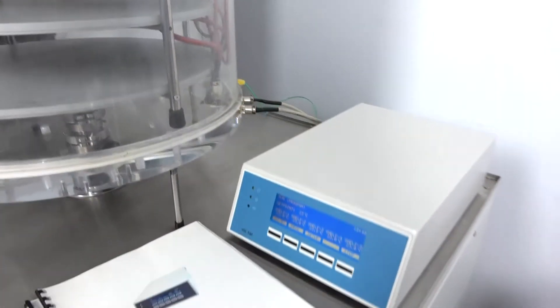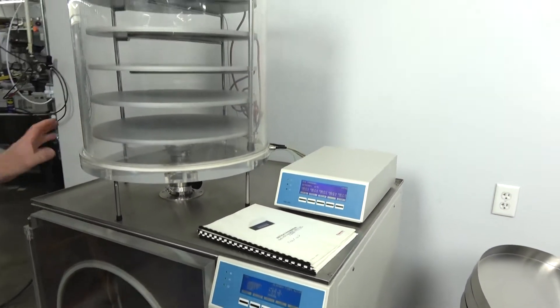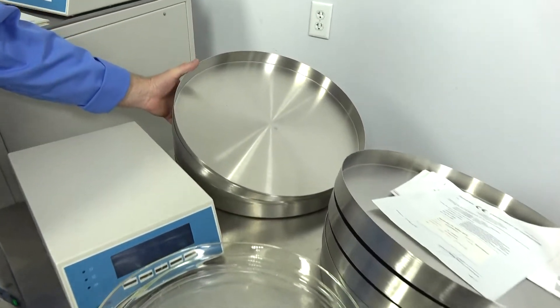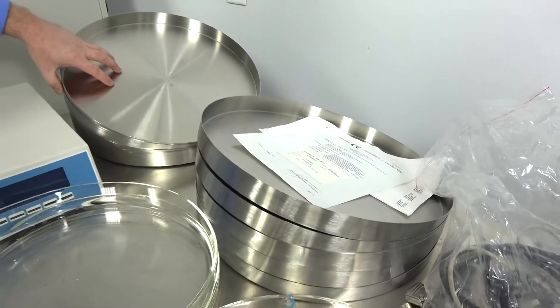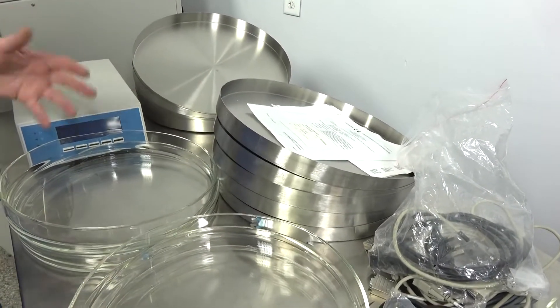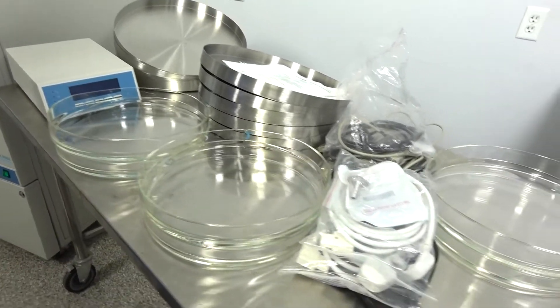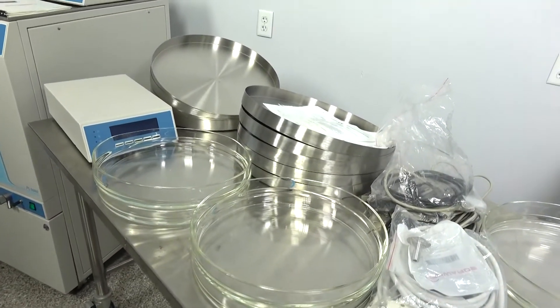Some items might need to thaw a little bit quicker than others depending on what you're freeze drying. It's definitely a huge chamber and it utilizes these petri dishes over here. There are actually two sets of five, which makes it nice so you can be prepping for a run on one set of five and then have one set in the chamber freeze drying, making a quick swap to continue. We also have glass petri dishes, so if you prefer glass for specific products, that gives you that option.